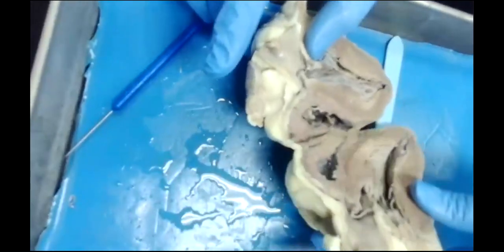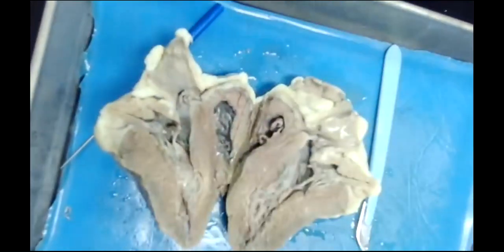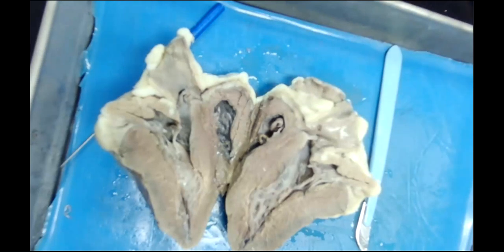That's probably about as good of a cut as we're going to have of that. Are there any structures that you all want me to try and find in this pig heart before we just kind of call this dissection a day? So is there anything else y'all wanted me to see if I could find?